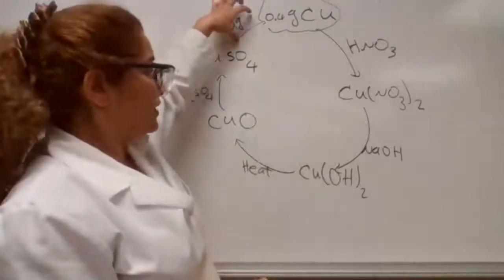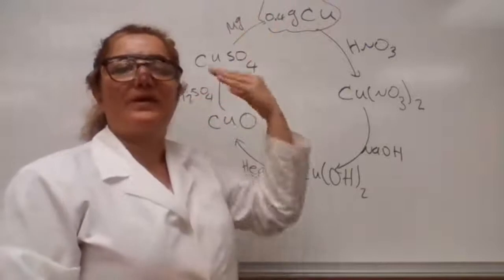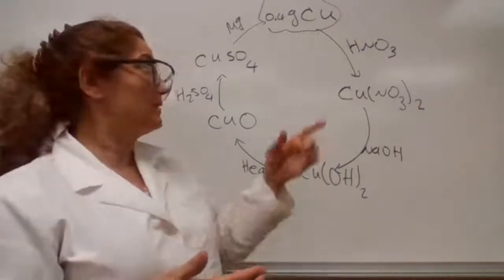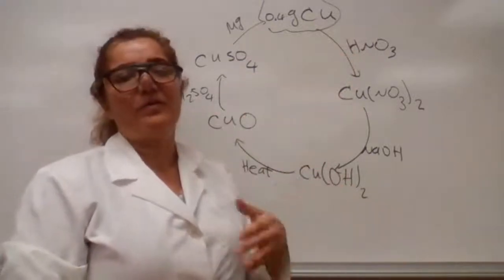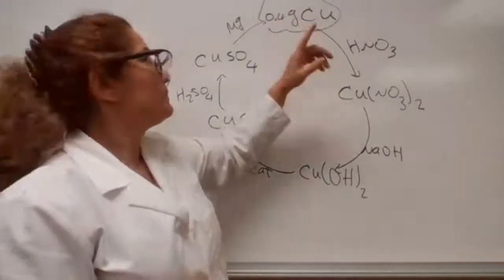The magnesium that you are adding, if it doesn't react completely, and you don't add extra acid, or you don't wait long enough for the magnesium to react, if there is leftover magnesium, it is going to add up to the mass of the copper. So you could get more than enough copper, so the mass could be higher than 0.4.